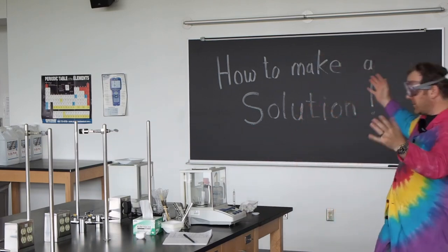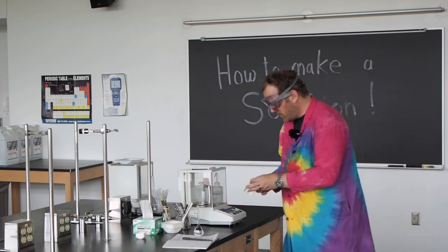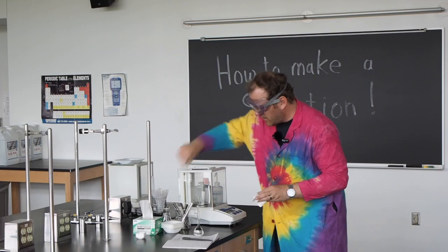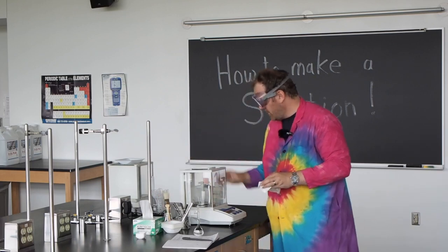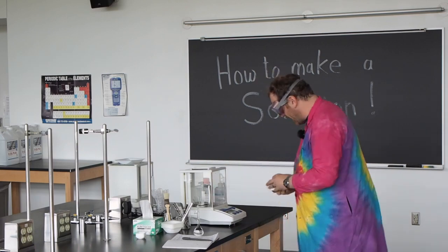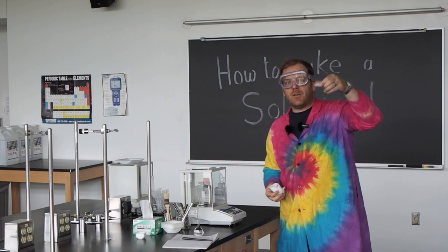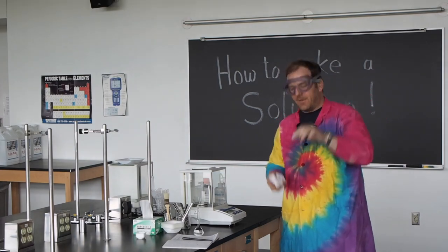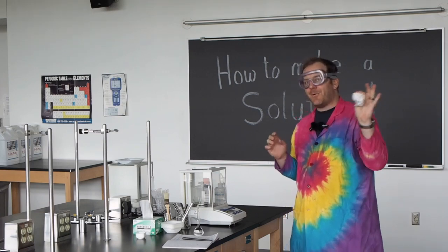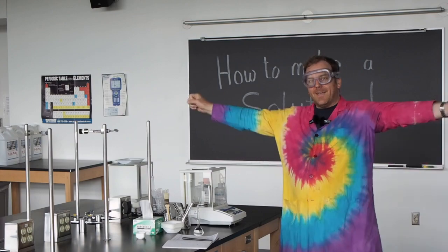All right, so there we go. We've made a solution, and I'm going to clean up this space here, make sure this is closed. We haven't left any solid in here on the balance. The cap is on the container, and I'm not leaving a mess behind here. And my weighing boat is garbage. I don't want someone to accidentally use it thinking that it's a clean weighing boat, because it's not clean anymore. It's used. I'm going to throw it away. And now I'm ready to go do some more science. Yay!